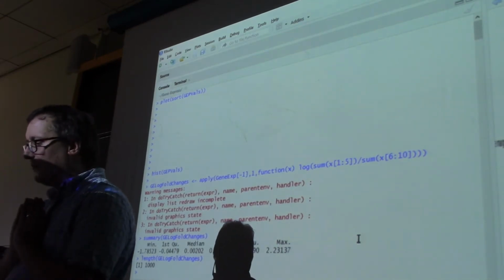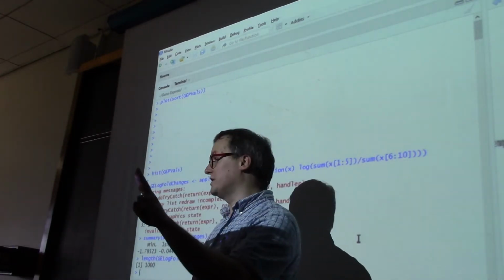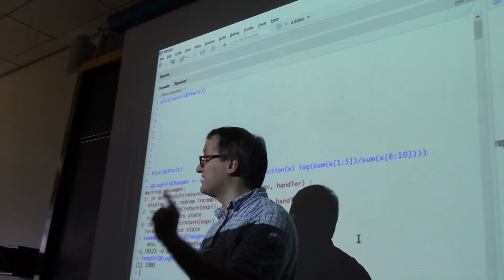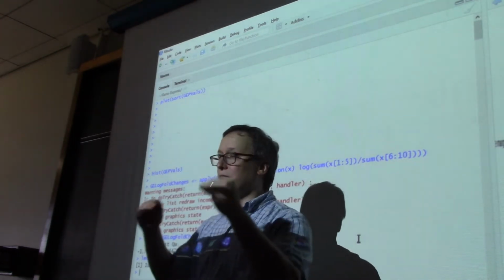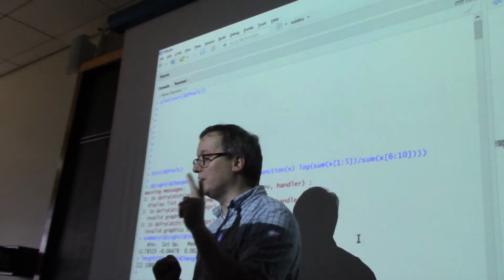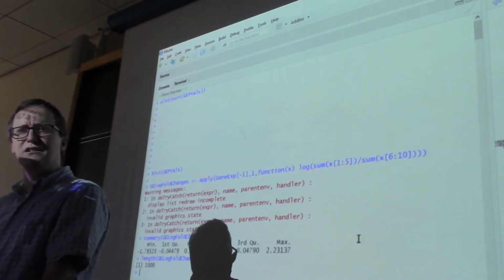Okay, so now I have for each gene 2 different values that I've computed. One is, what is the p-value associated with the statistical significance of any difference between means? The second part is that I've computed log fold changes. Now, why did I do log? That's kind of odd, isn't it?